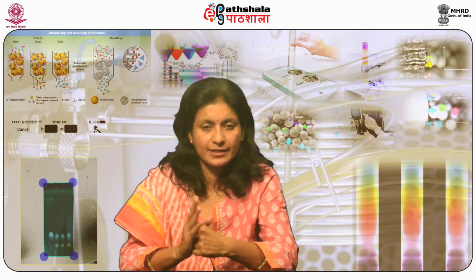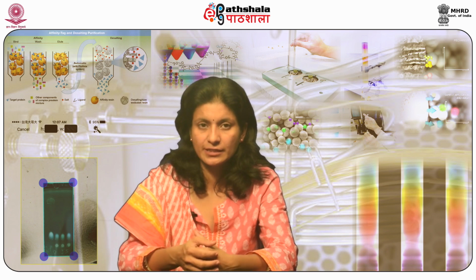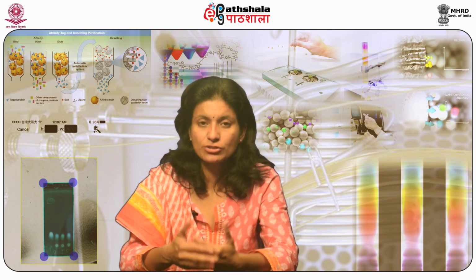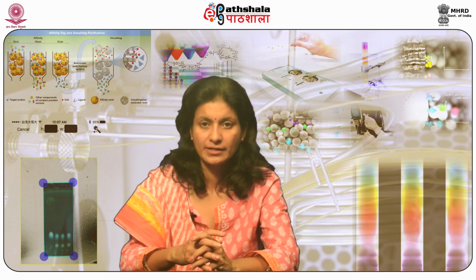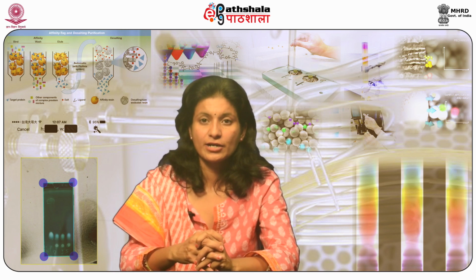Significant examples. One of the significant examples of this technique is the evaluation of total cyanide by IEC. The cyanide is complexed to metals such as iron, and strong acid digestion in the presence of magnesium chloride catalyst is required to liberate cyanide.